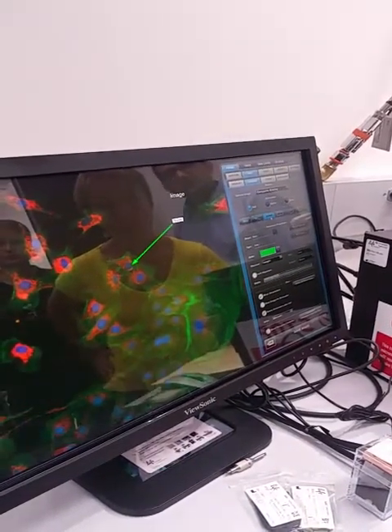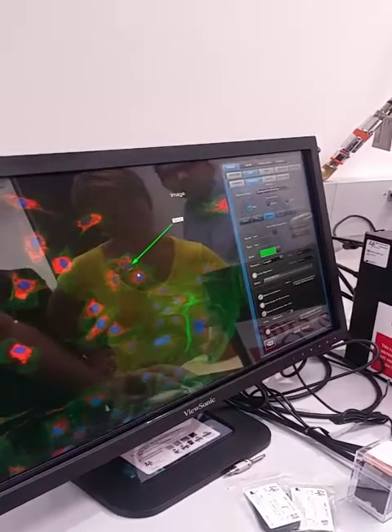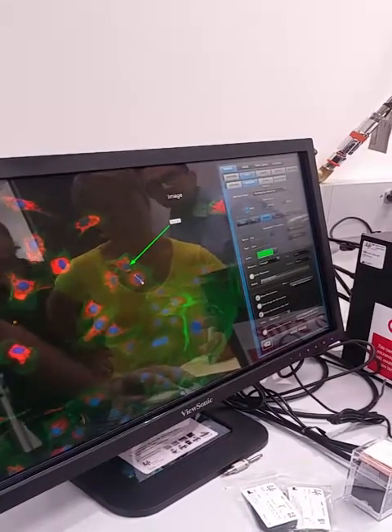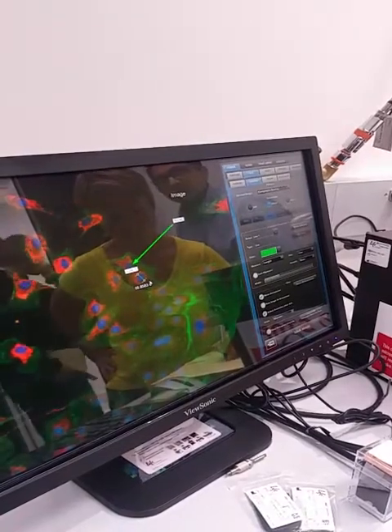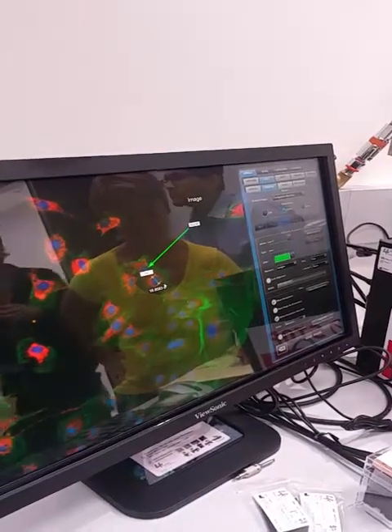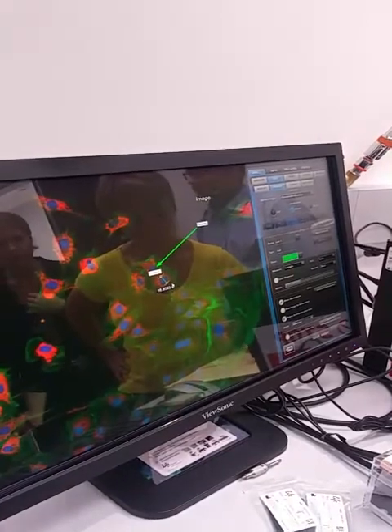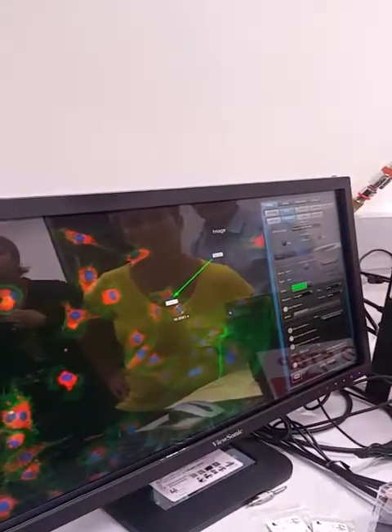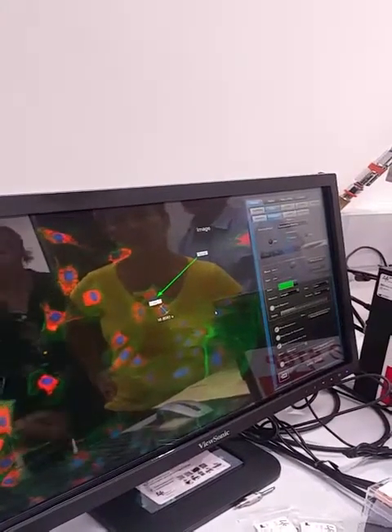This is your line tool. It allows you to measure distances — you can click and drag to measure distance. This can also function as a makeshift scale bar if you want to create your own. The measurements are in microns, not pixels.